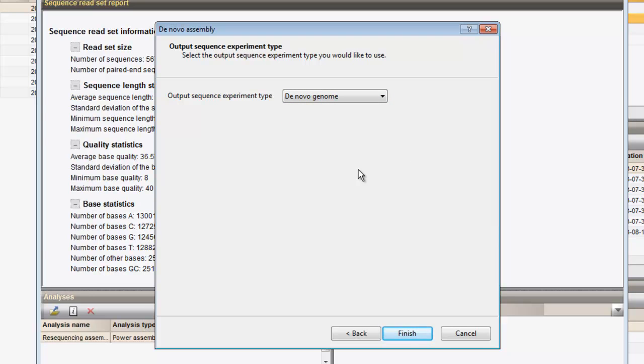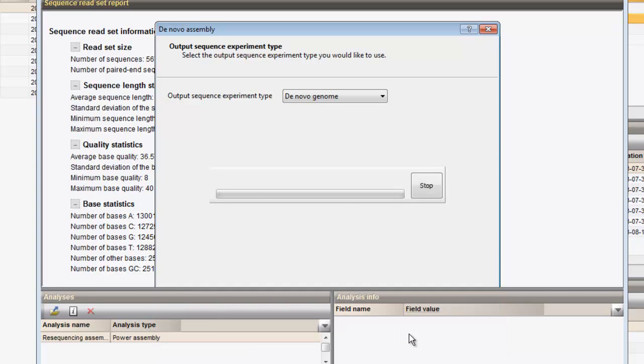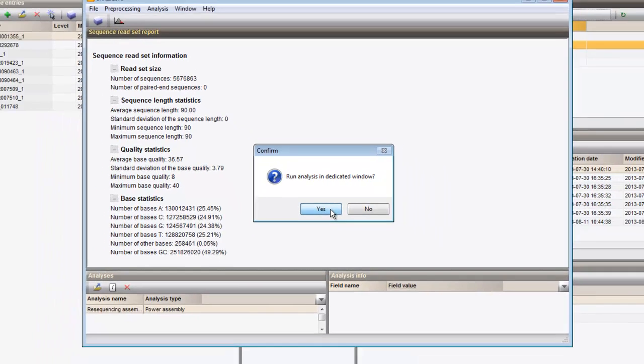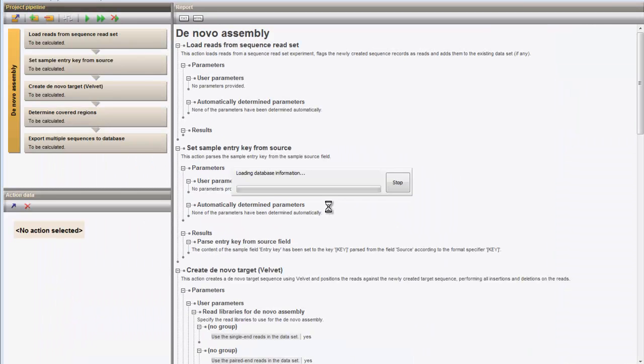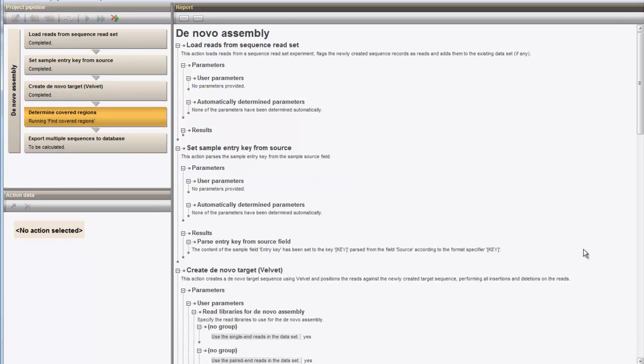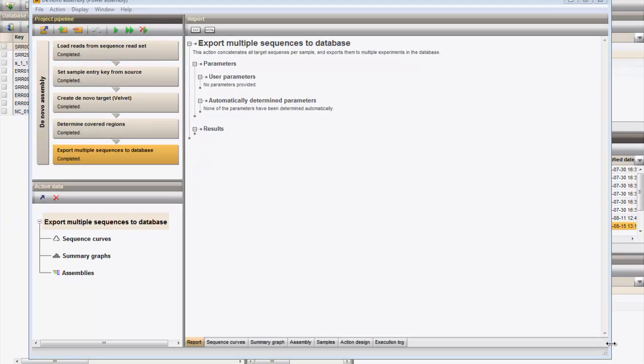After confirmation, the power assembly window will pop up with the de novo assembly pipeline in place, and the calculation automatically starts. Once the calculations have finished, the de novo contigs are concatenated and this concatenated sequence is saved to the database.